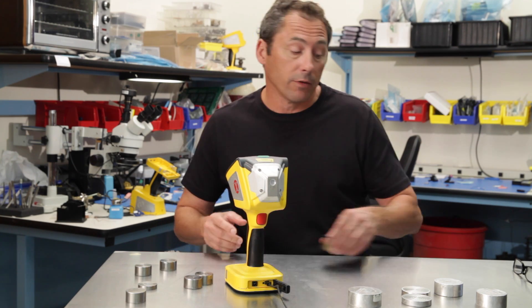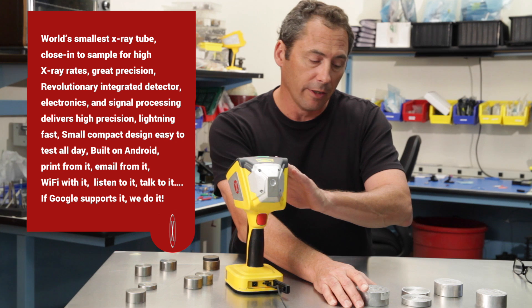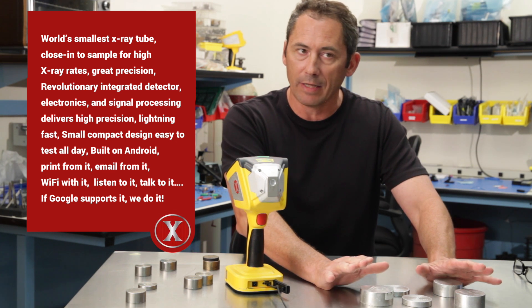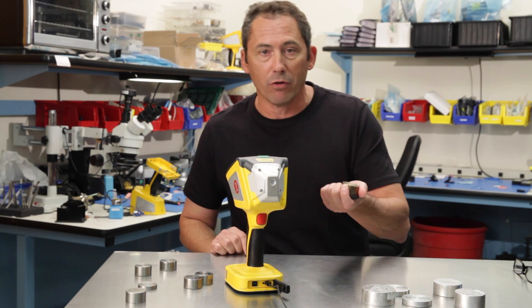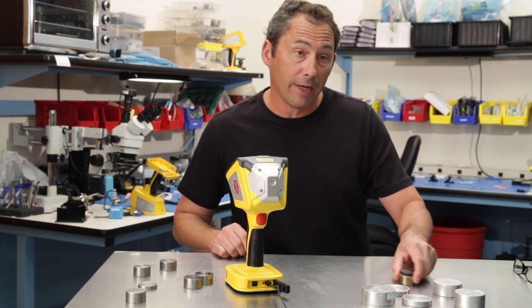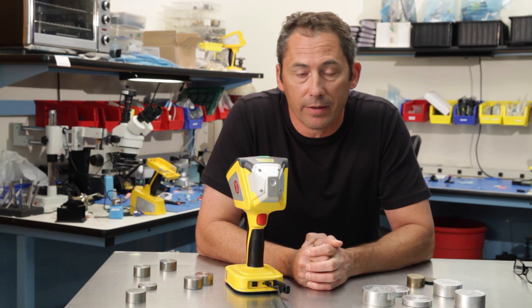In summary, you can now improve your productivity on aluminum — if you want to use X-ray for aluminums as opposed to LIBS — by at least a factor of three to six depending on what technology you're using now, because we're doing all these in less than ten seconds total. Even faster on your aluminum bronzes: about five seconds. You're doing your 303/304 separation in under five seconds, measuring the sulfur. That's really the story behind the new two-beam technology now available on the Psi Apps XRF analyzer.